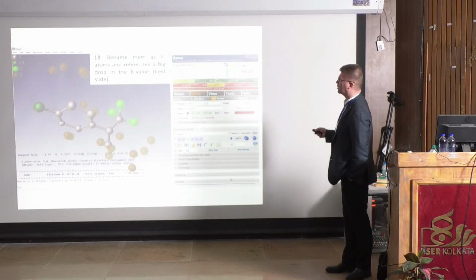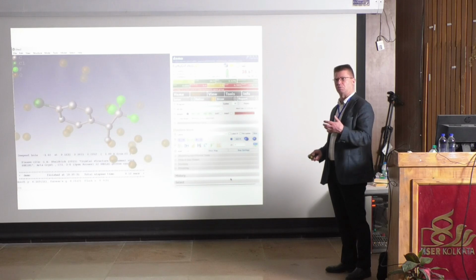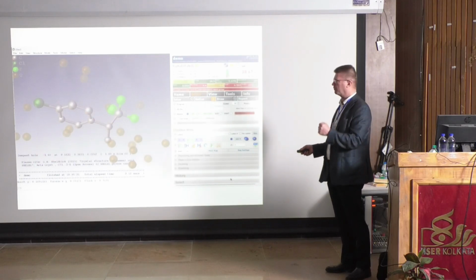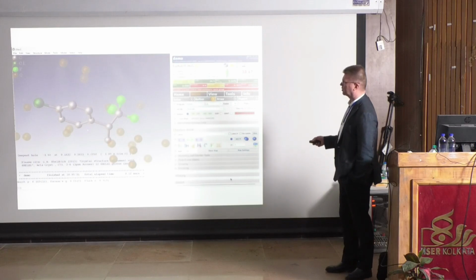We now go back again to this refine, and let's see what happens. Look, this number is going down all the time. So this number tells us that our model, what we are looking at now, is more accurate. It fits better to the data. That's the idea. Now you can also notice that the balls change slightly. They become more of a unique shape and size, but that's a movement. Okay? We have this here, and then the fluorines are there, with additional brown peaks in there.